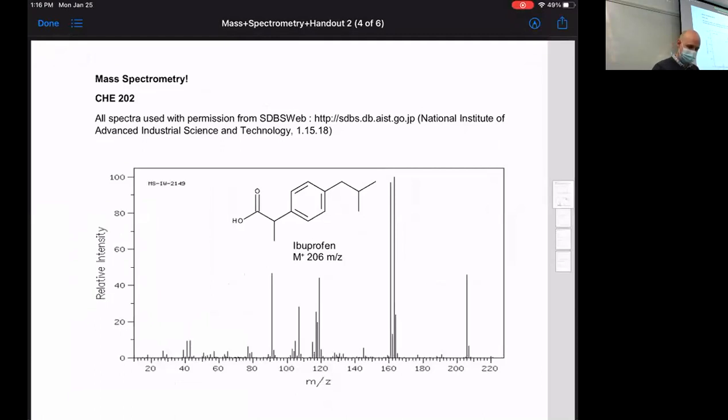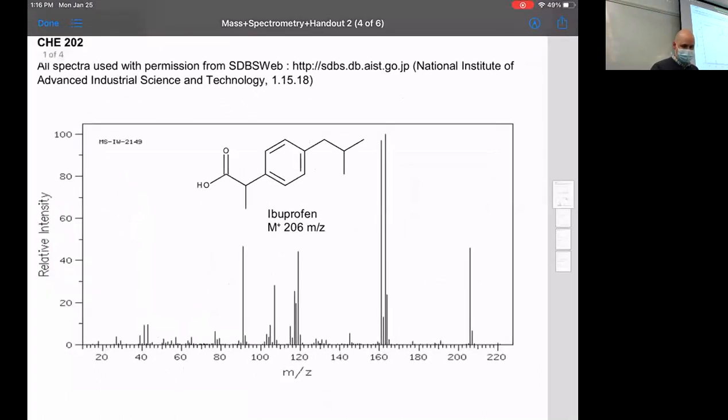All right. So this is what it would look like when you get that information from the detector. These peaks here, all of these peaks are indicating some ion hitting your detector at some different place. These are the ones that have had their path bent more. These are the ones that have had their path bent less. These are the heavier ones that it had less of an impact. These are the smaller ones that had a greater impact.